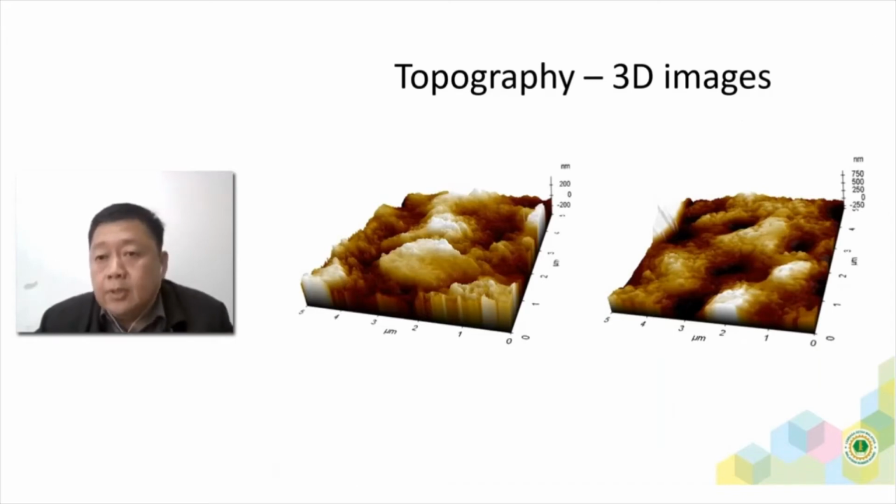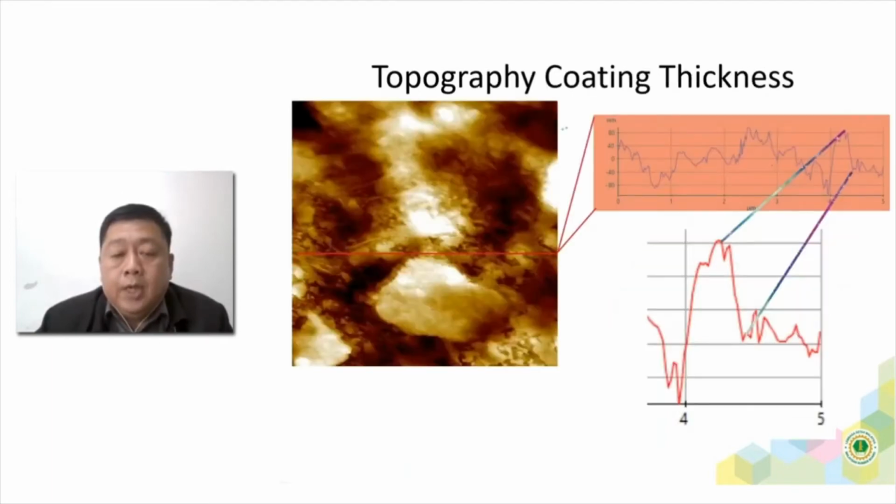As for the sample on the right, it seems to be a little bit flatter compared to the one on the left. Okay, never mind, I'll show you again later on. Later I will show you some live measurements using the AFM software. So these are the results that we got for this particular sample from the industry.